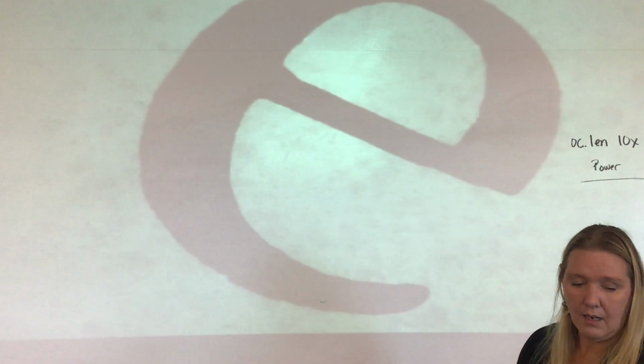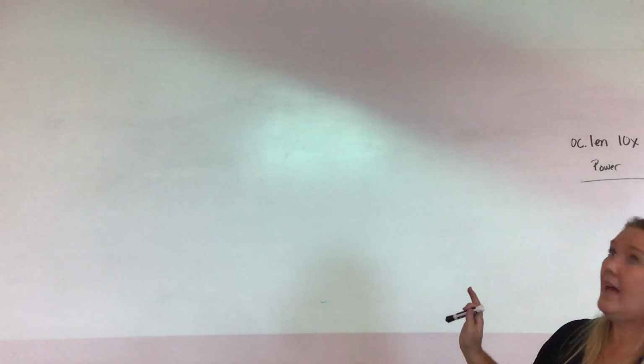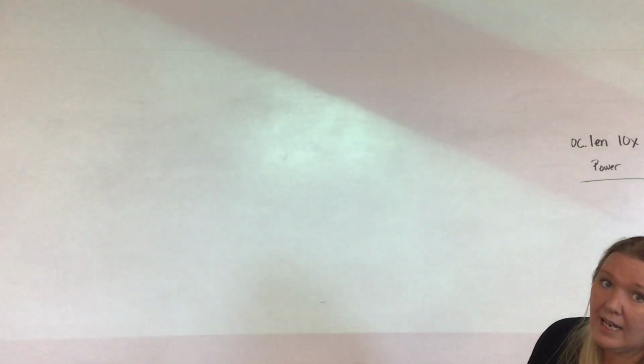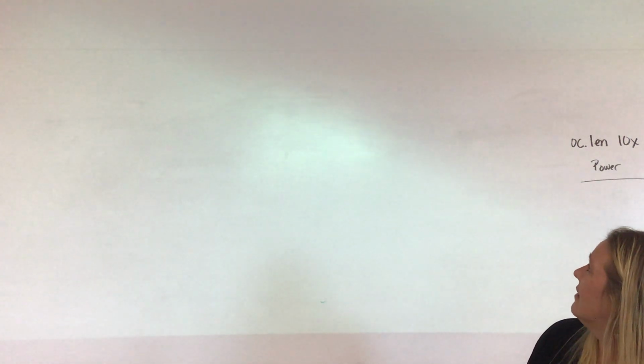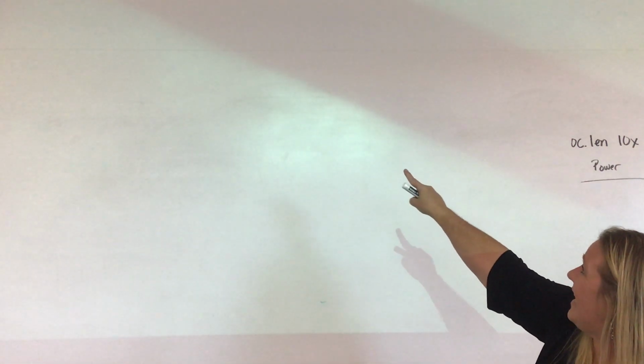And then we would put the high power in, and that's really blurry, right? And so I would use the fine focus only to go, oh no, I went past. I have to go kind of slow to focus and try to find an easy edge.